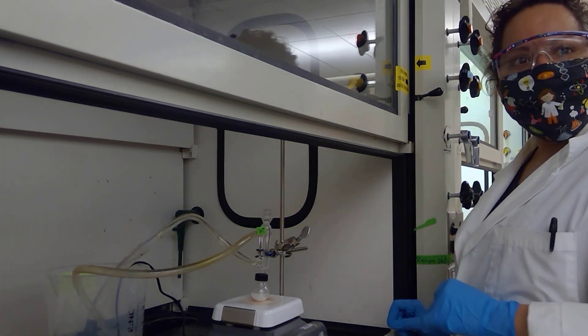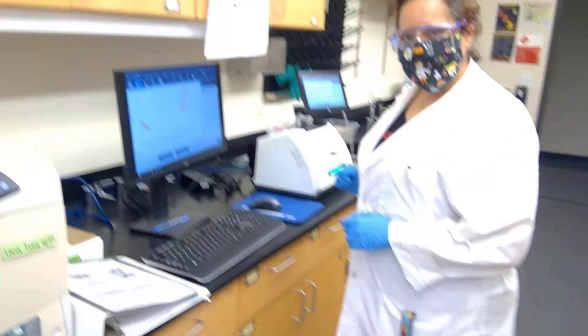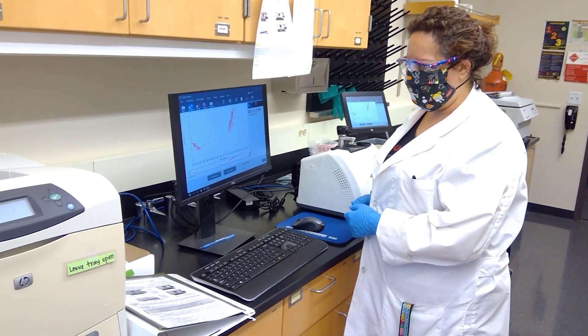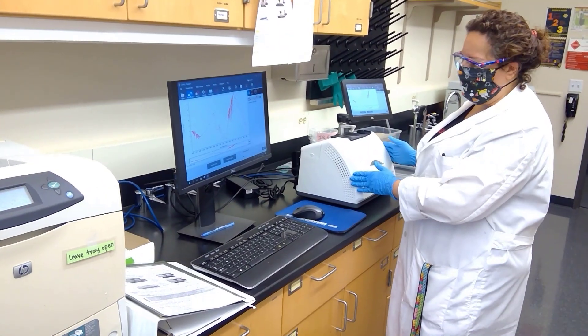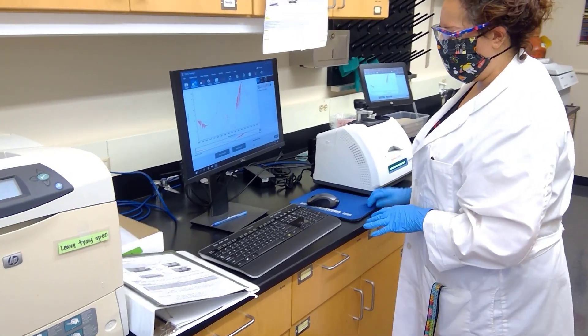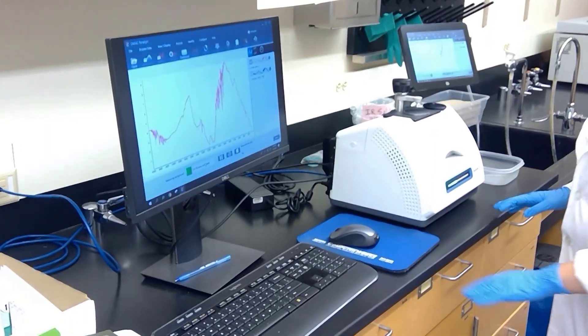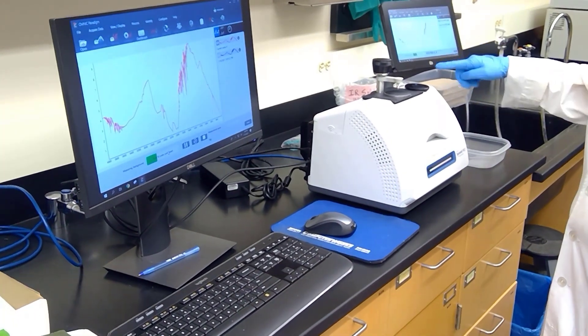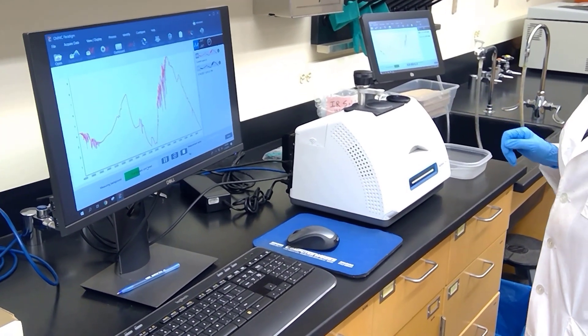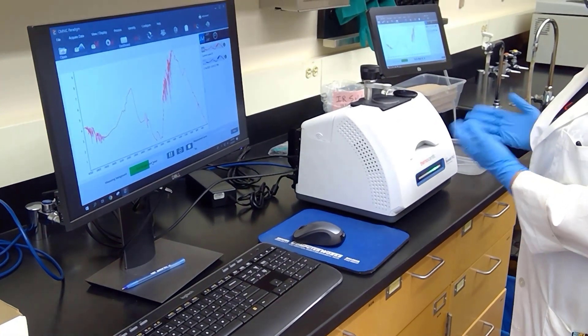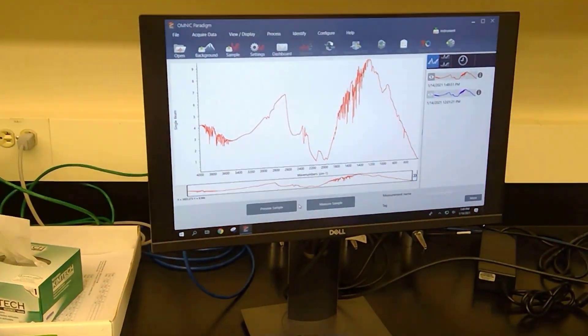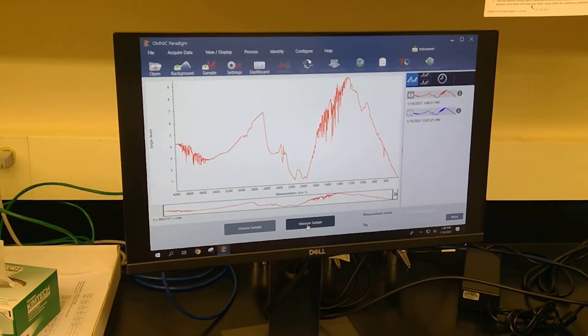Next up we are going to acquire an infrared for our acetaminophen sample. This is our infrared machine and it is hooked up to a computer display. I'm going to ask it to run a background for us. Currently as it's scanning for background, notice that I have the apparatus here up, and I'll explain in just a moment what I will do in order to actually scan the sample.